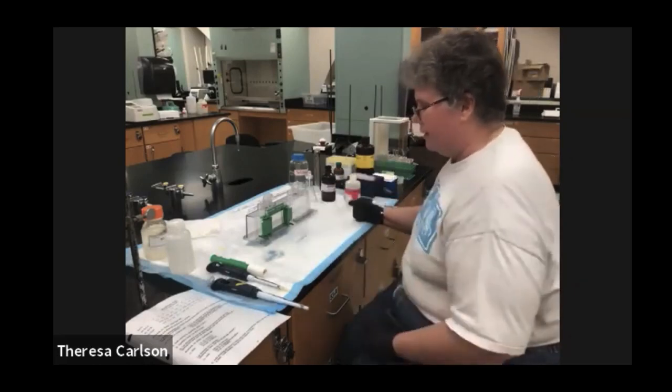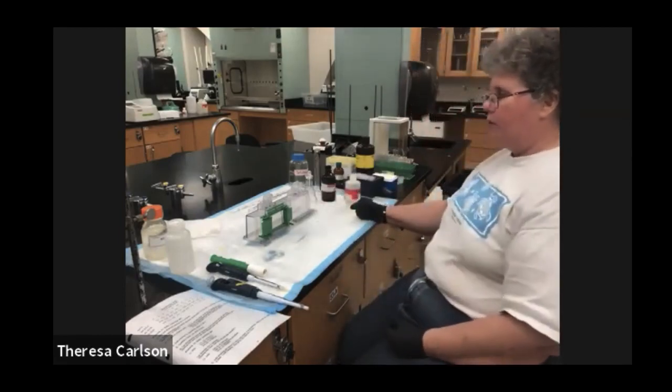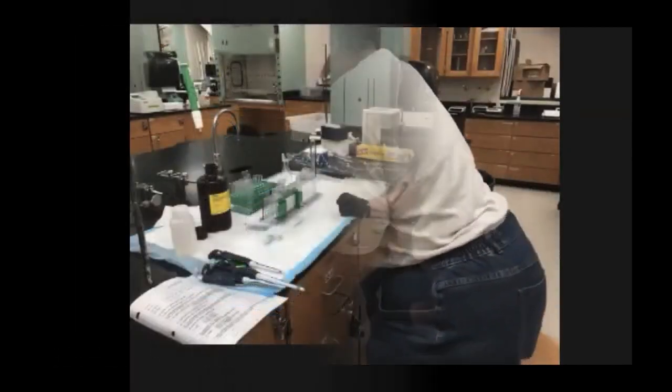So you're going to wait, again, about 15 minutes for this to polymerize, and at the end of it, I will show you what it looks like.